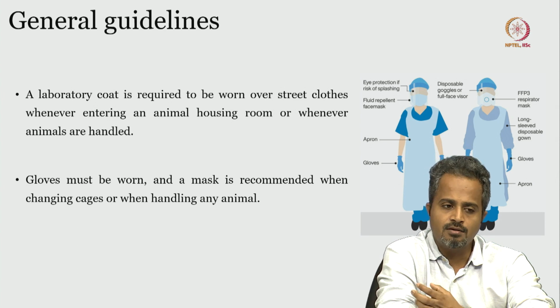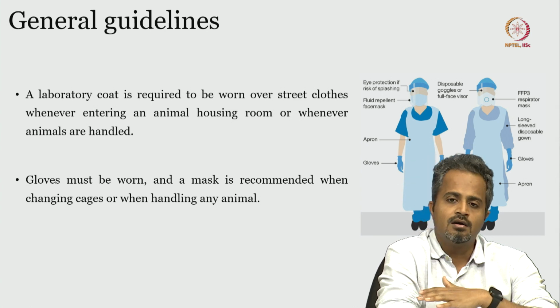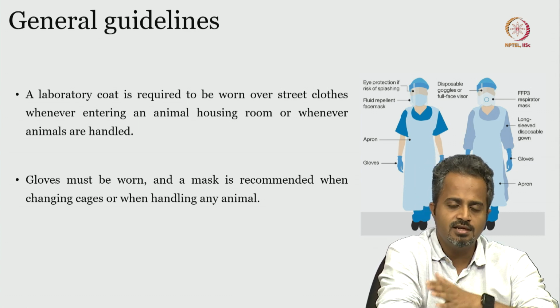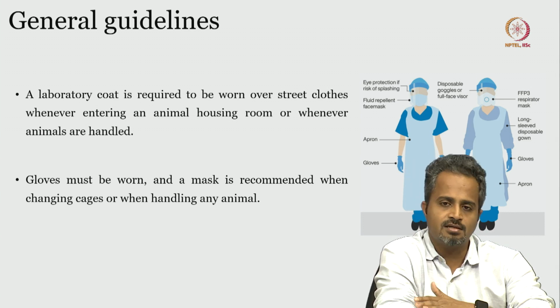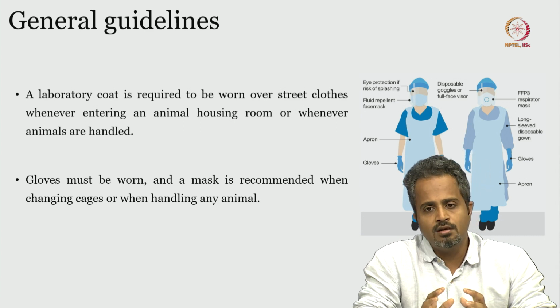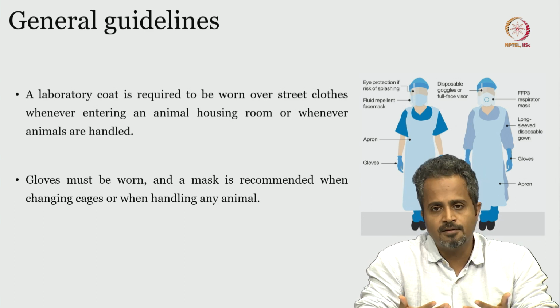If you're going to handle the animal in terms of surgery, then you might as well wear clean gowns and clean gloves until you actually start the surgery, and then just before the surgery you change these. Unsterile, just clean, but not completely sterile. They can have a few organisms, but you're just handling outside the rodent body. You're not making an incision, you're not cutting, you're not really starting any surgery.